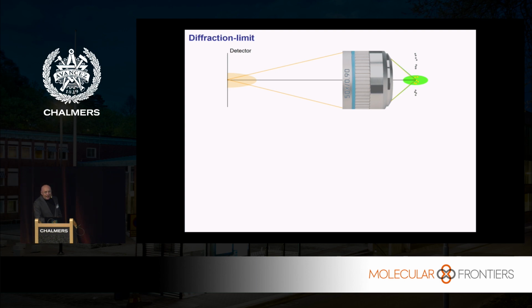They will light up and produce, of course, backscattered light. Now, in our case, the backscattered light is fluorescence light, so light of a slightly longer wavelength, which is collected here in the detector. And now you can imagine that each of the molecules also produces a wave of fluorescent light that is also diffracted. And even here at the detector, we will get this diffraction blob for sure. Each of the molecules will produce a blob of light that will inevitably overlap in space due to the finite size of the spot of fluorescent light in the detection range. And as a result, it's not possible to tell the molecules apart at the detector.